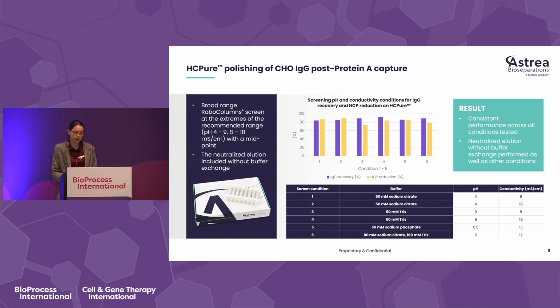So HC Pure primarily uses hydrogen bonding and hydrophobic interaction modalities for the binding. So it's not an ion exchanger. You can't predict where the product will bind based on its pI. You have to do the screening to be able to work out the best conditions.